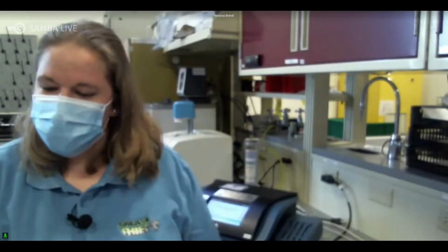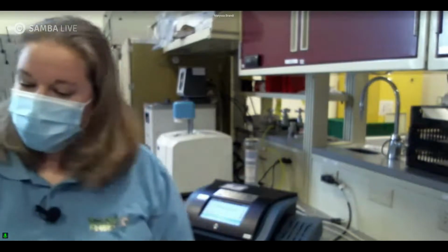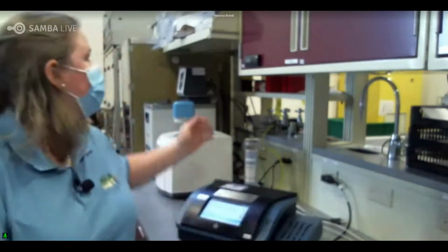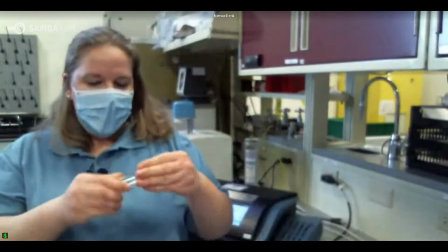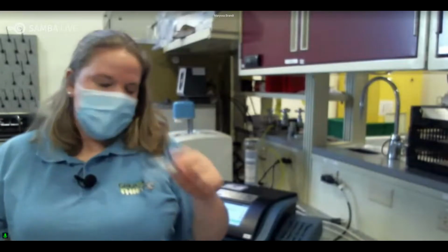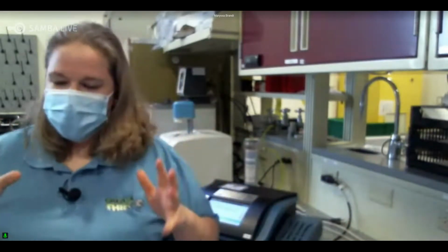Yeah, absolutely. What you can do is run a system calibration with an empty vial, and you can run that into the instrument and see what readings you get. So if you get a super high reading, if you get 1,000 ppm of moisture, obviously your vial is not clean or dry. I would assume that at that point you would probably see some droplets, but you could definitely run a blank vial. You can just grab a blank vial and a blank cap, and it can go into the instrument, and you can run that and check to make sure that it is clean and moisture-free and able to be run.